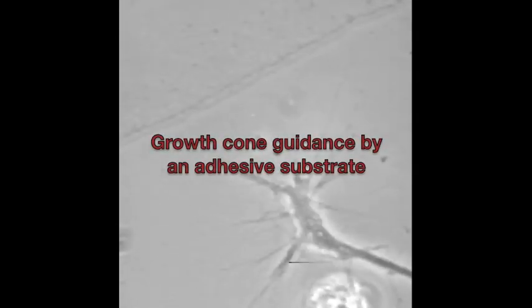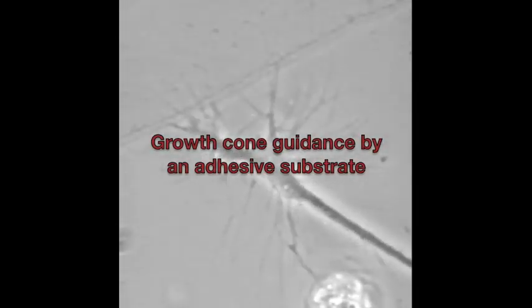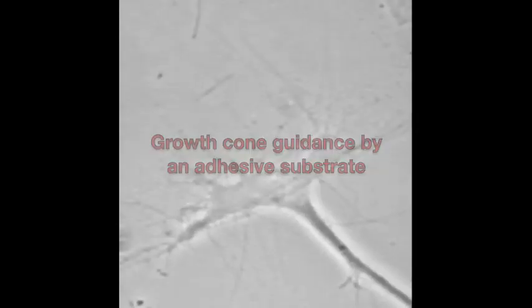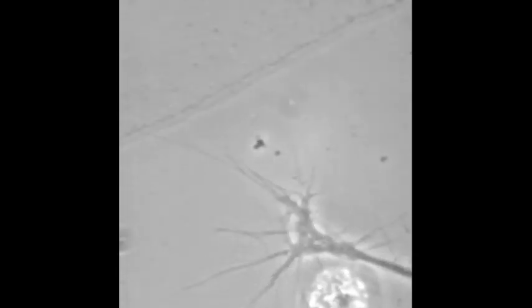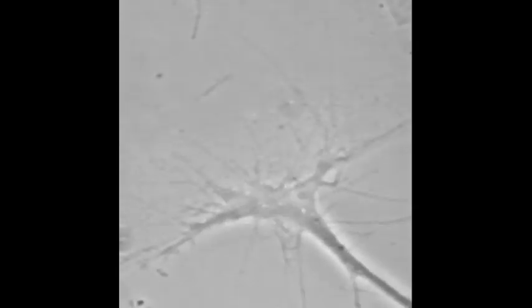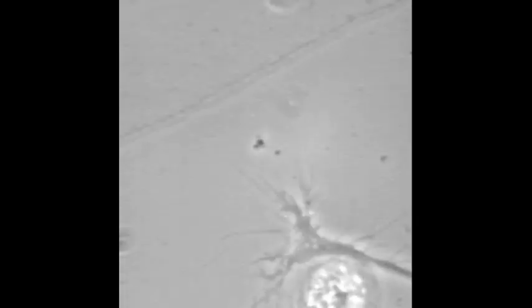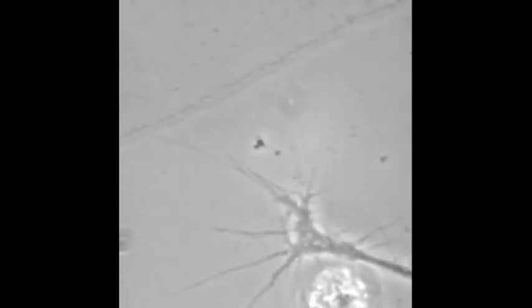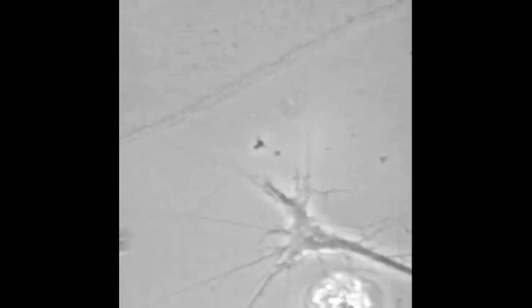In this movie, a sensorimotor growth cone crosses from fibronectin to a laminin-coated surface. Filopodia extend in all directions from the growth cone and reach 50 microns to detect the laminin and start the turn towards the border.